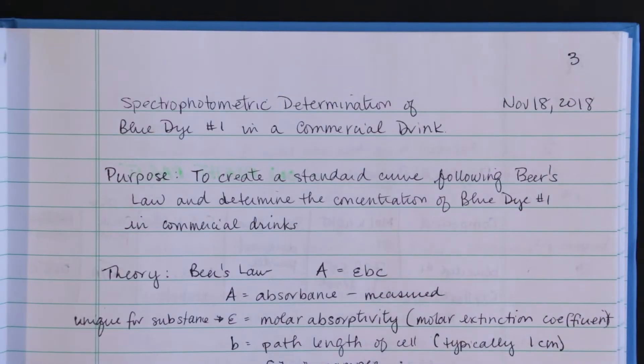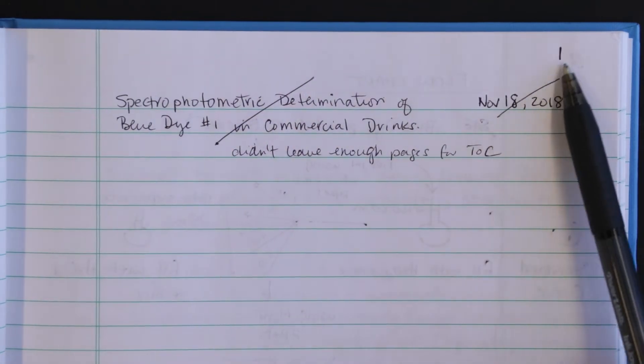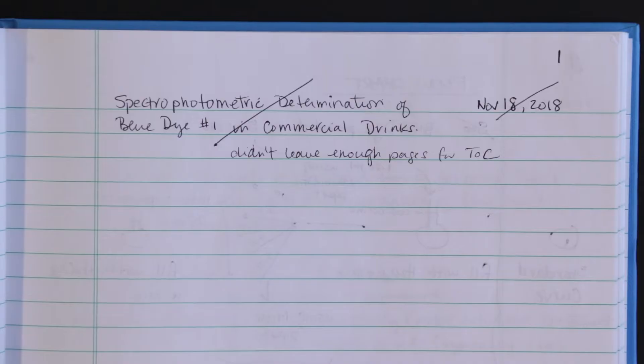Date every page. If you're finishing an experiment at a later time, the new date would reflect that. I made an error, so I drew only a single line through all errors written so they can still be seen. This is proof to auditors that you are not hiding anything.